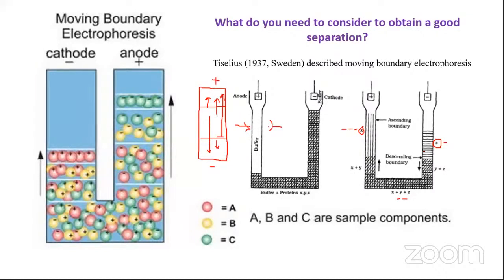Nobody? Strange. What if I keep the pH of the buffer, say, equal to 10? This is a very large value, but still. What will happen to most of these molecules if the pH is 10? If all are proteins, what will happen to these molecules if the pH is 10?